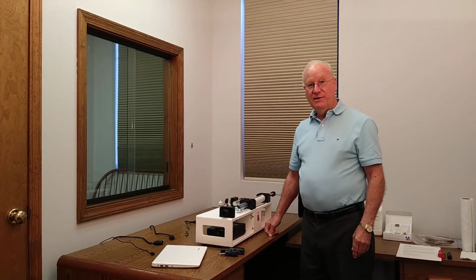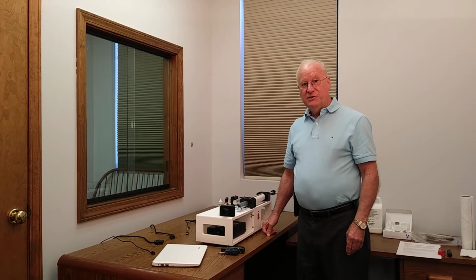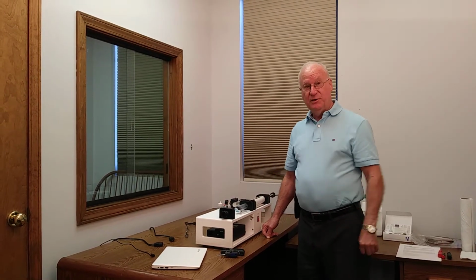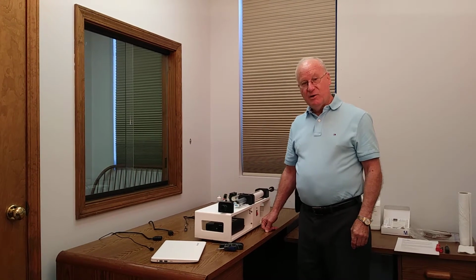My name is Terry Lane. We have started making a series of videos to help our customers use the C-Vue HPLC more effectively. Today we're going to show you how to get it out of the box, set it up, and get started.